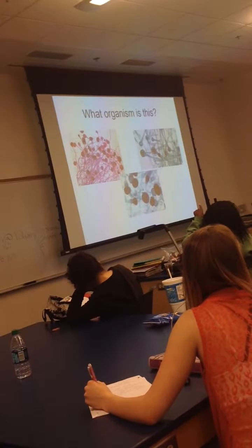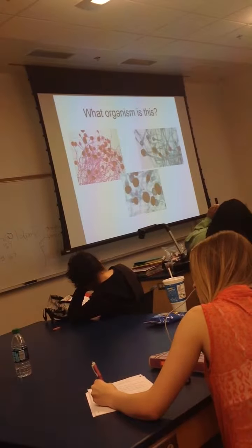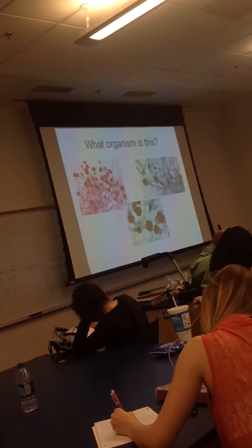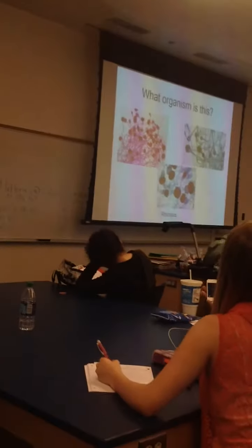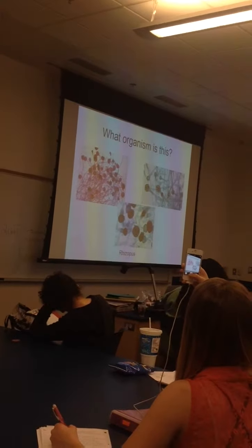Black mold? It is black bread mold. What's the proper name for it? Rhizopus. And it is a zygomycete. You guys are killing it. Okay? This is Rhizopus. We looked at it in the slide.